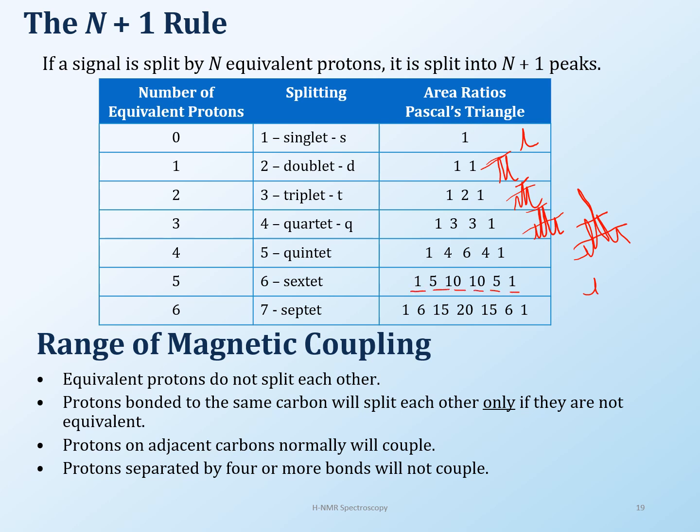You're not going to draw this exactly, but you can try and get this kind of a signal. That's what a sextet would look like, and a septet would be when you have something really long in the middle. So there, that's the middle one. Then here, something like this. So 1, 2, 3, 4, 5, 6, 7. All right, so you have that kind of a splitting going on.